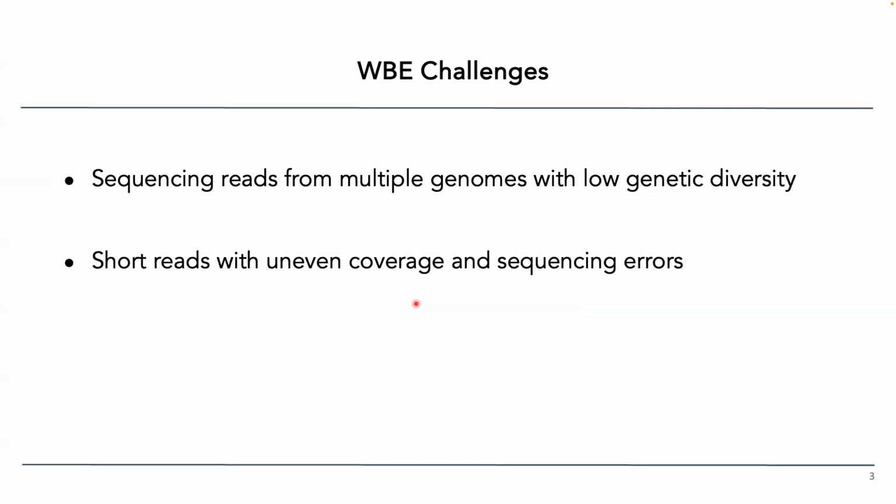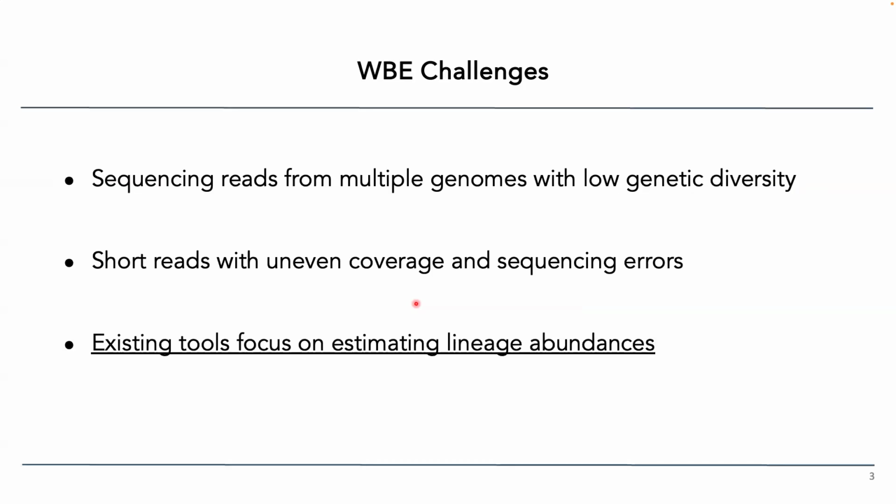It also gets more challenging with the small sequencing reads obtained from the wastewater, and the sequencing errors make the problem more difficult. Due to these challenges, existing tools only focus on estimating lineage abundances, thereby not utilizing the full potential of wastewater.